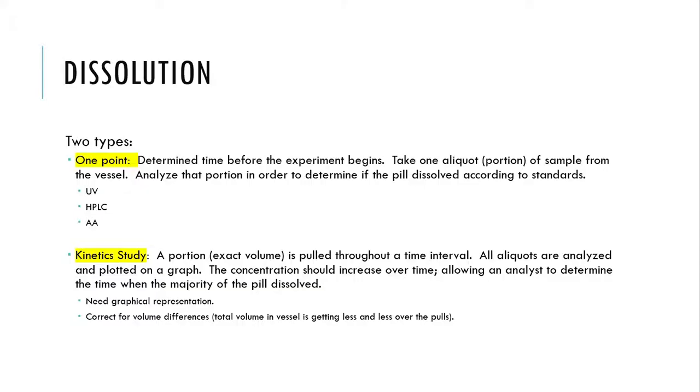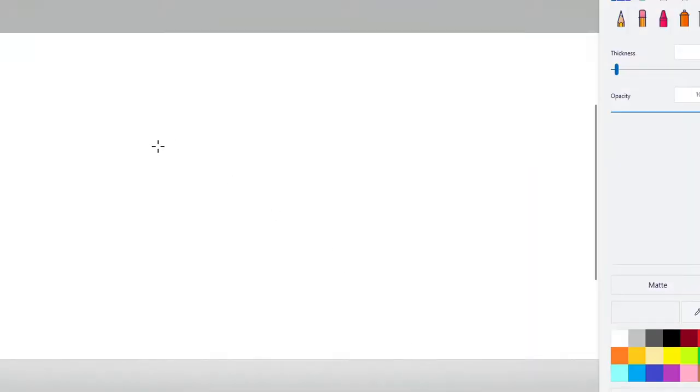And that's it. All right, so a couple of things that I need to talk about as far as dissolution goes, and usage of the dissolution. So here we've talked about a vat now, and on the inside of this vat, I have a pill with basically a solution. And over a course of time, I'm going to take an aliquot of that solution and I'm going to measure this one and analyze it in some form or fashion after this time interval is over.